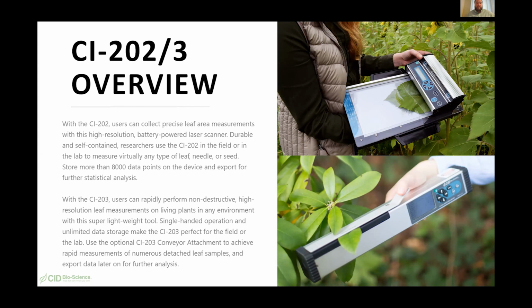And then, what is the reproducibility and accuracy of data? That's a great question. I am fairly certain that, I think we did a study where if the leaf is greater than 10 centimeters squared, or the leaf length is greater than 10 centimeters, one of the two, our accuracy is plus or minus 1%.